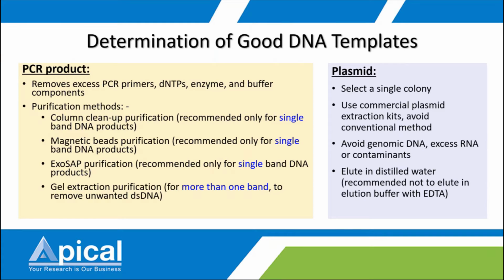For the conventional method, where you prepare the lysis buffer yourself, we advise you to avoid it and use a commercial kit to extract your plasmid. Commercial kits come more complete, and the lysis buffer is also more consistent. So try to use a commercial kit for your plasmid extraction.